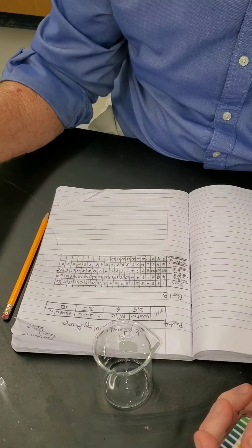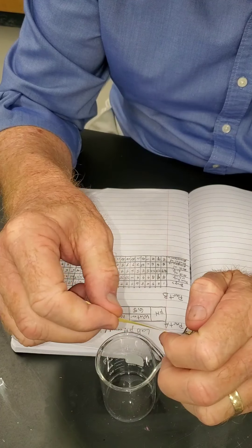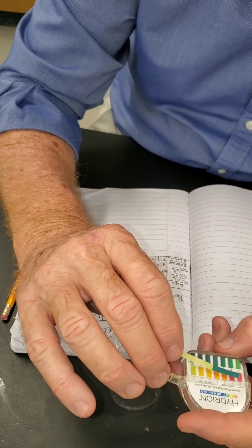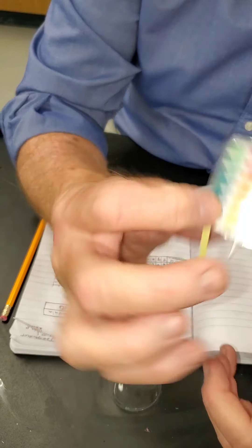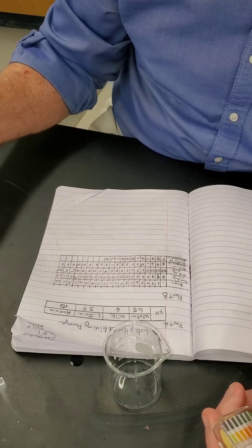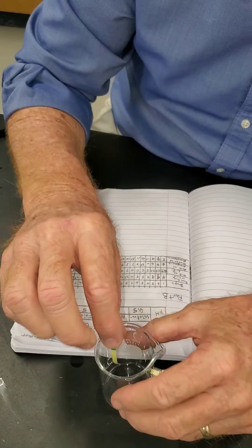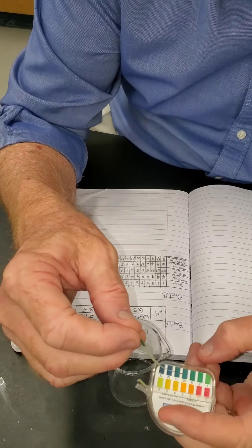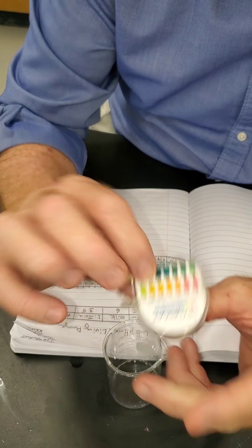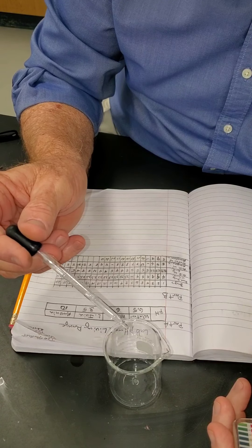Drop 12 — swirl it around, still 10. Does anybody think it's going to get higher than 10? Probably not, because the pure ammonia at its highest point was 10. So how could it get higher than 10? But just for the sake of the experiment, we're still at 10 and we're going to do the last few drops.